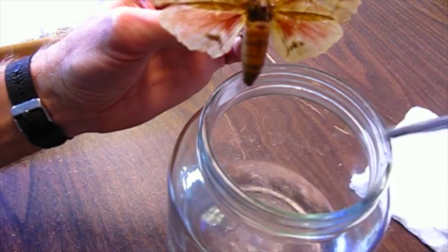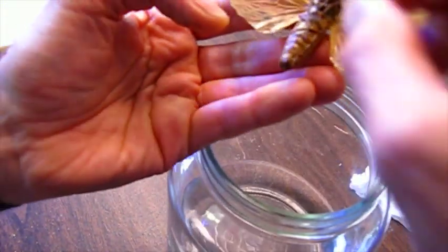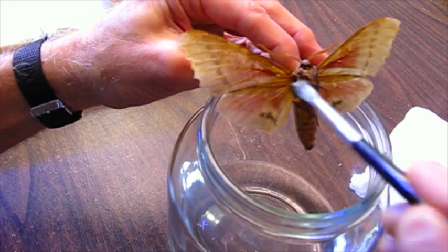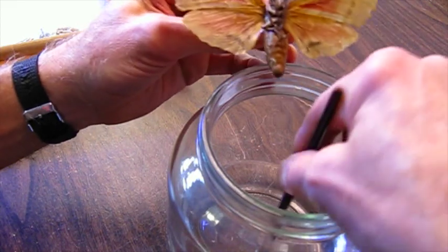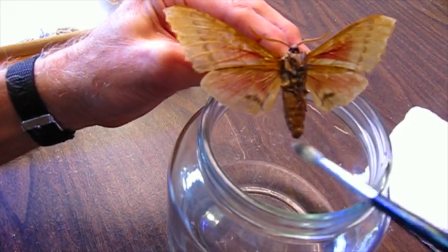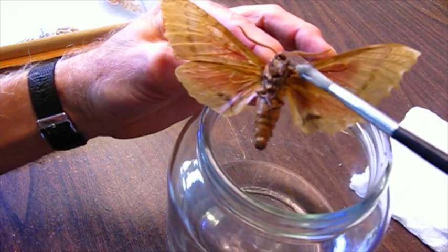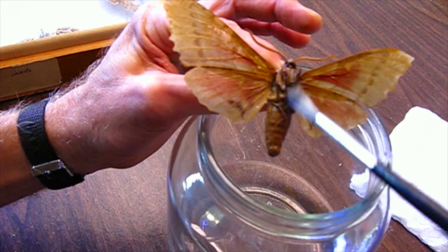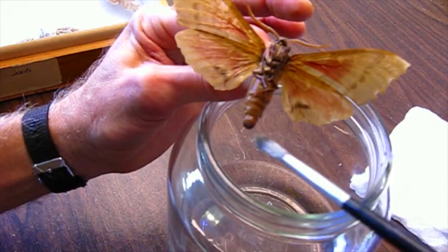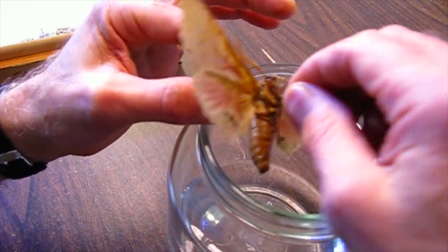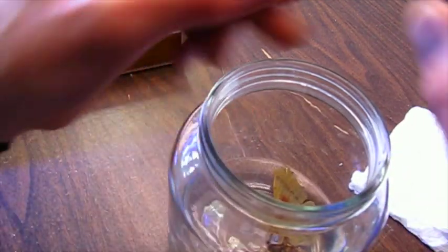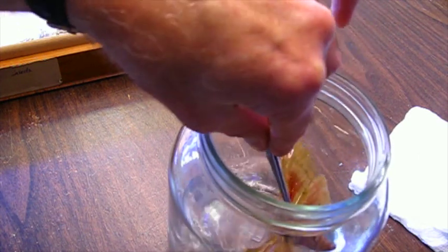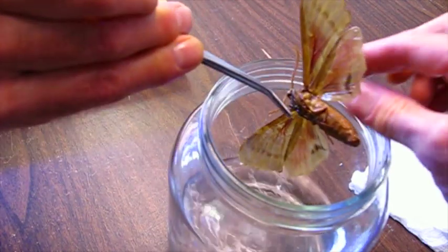Now flip it over and do the other side. I've done this before with specimens and I have not seen the mold return, so I'm pretty sure that the acetone actually kills the mold spores and filaments. Now I'm going to rinse it off, just plunk it in there and let it rinse, swish it around a little bit, and then let it drip.